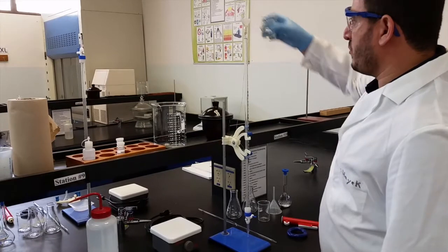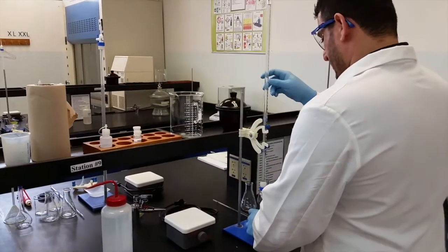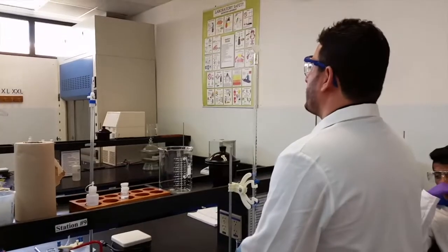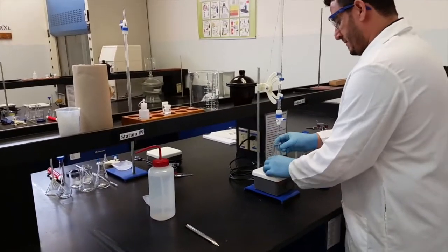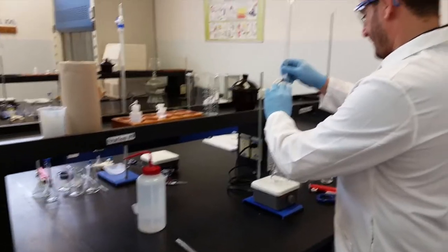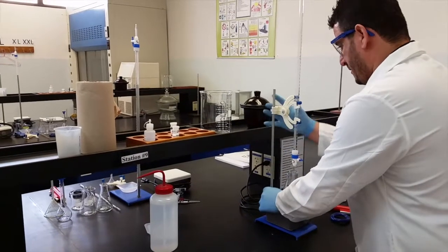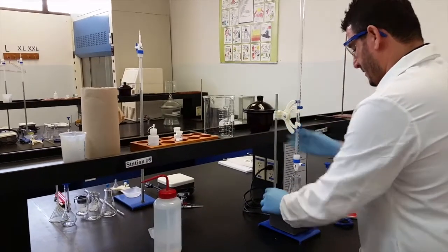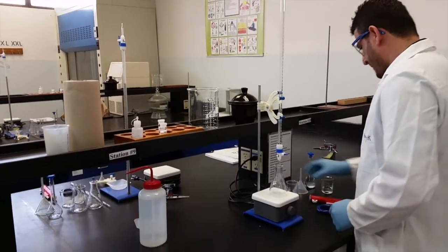You will add a little bit more than 0, and then you will calibrate it to 0. Put your magnetic stirrer, magnetic bar. Make sure your burette is inside it. Make sure your stirrer works.